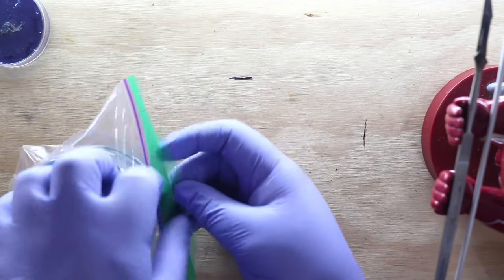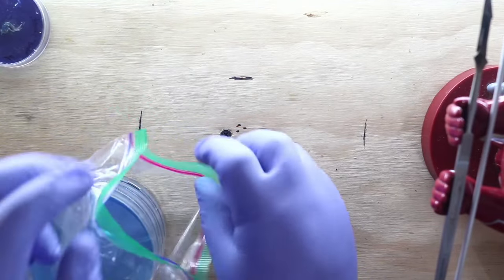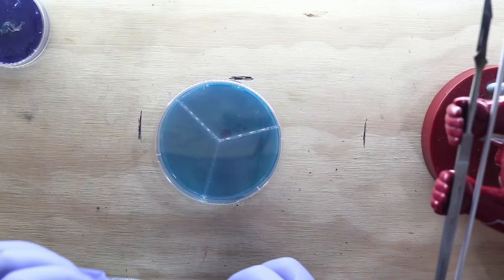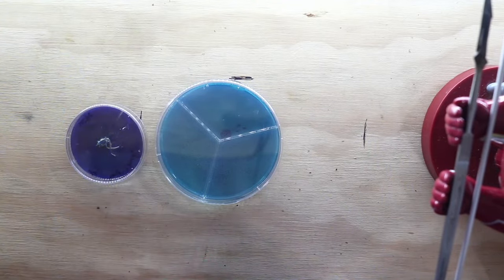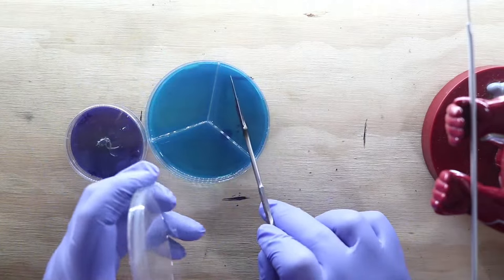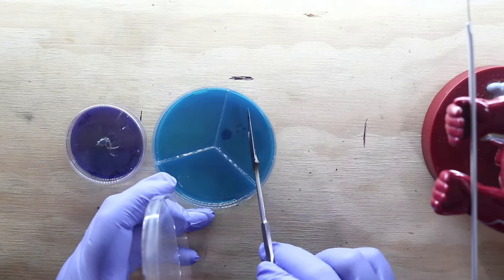First thing we'll do here, simple agar to agar transfer. I use these tri-plates, or these 60 mil plates that you see here. Now, what I'm going to do is I just cleaned that blade. I'm cooling it.